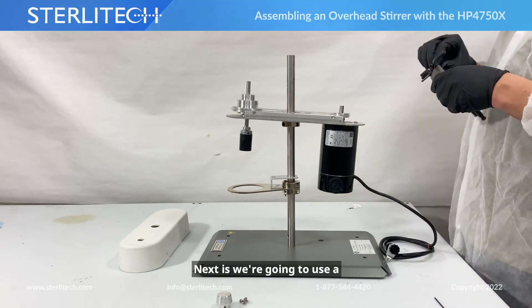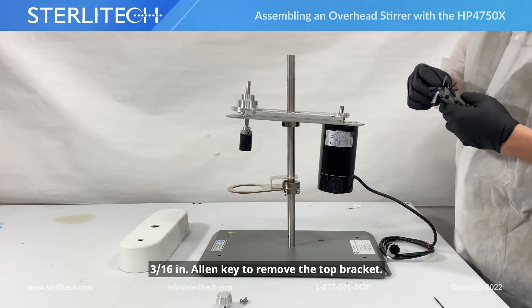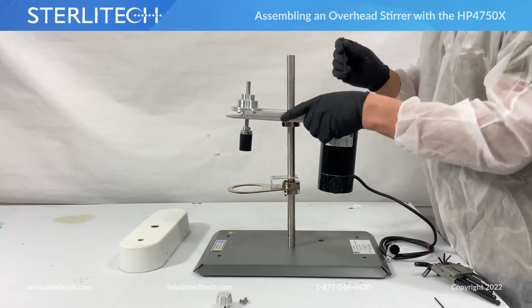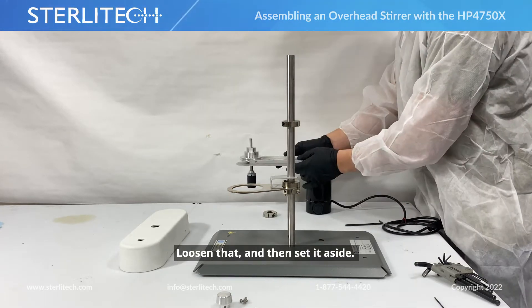Next we're going to use a 3/16" allen key to remove the top bracket that is in here. Loosen that and set it to the side.